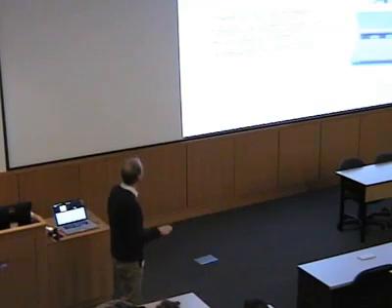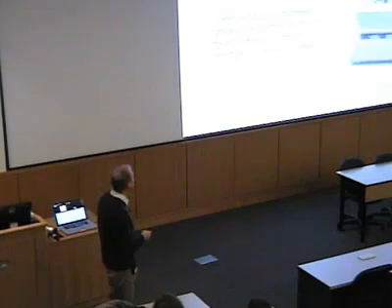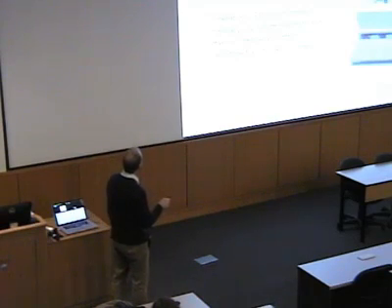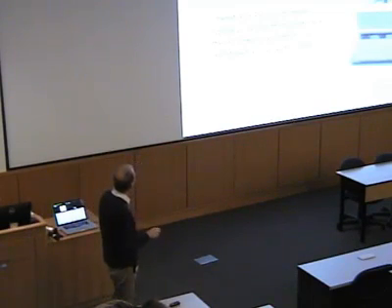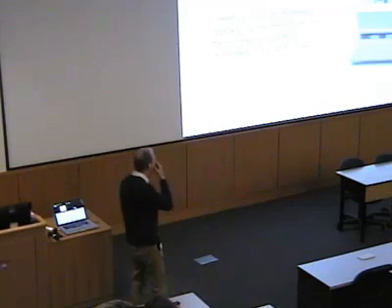Anyway, here's a picture of a standard spectrometer operating on the principles that I just showed you. What's important here is that if we look at the resonator that I just showed you diagrams for, the width of the resonance that we're using in frequency units is maybe on the order of 1 or 10 megahertz, something in that kind of ballpark.